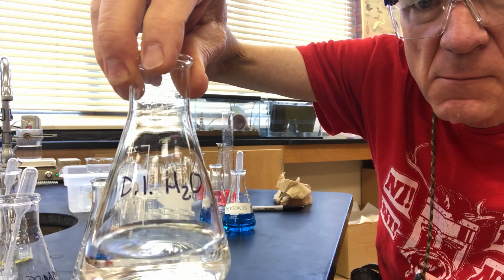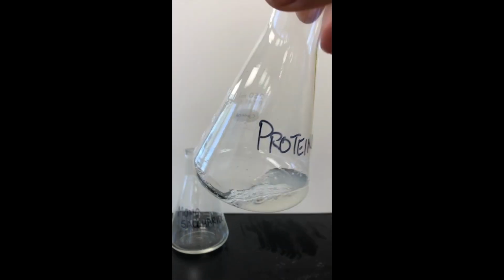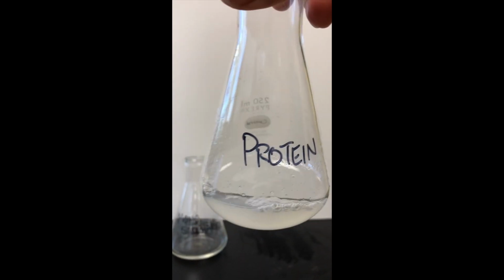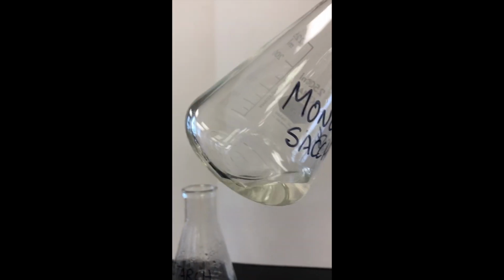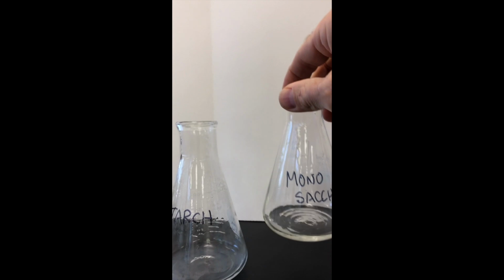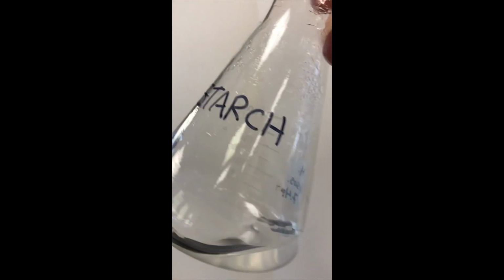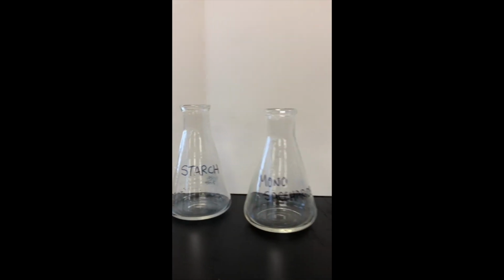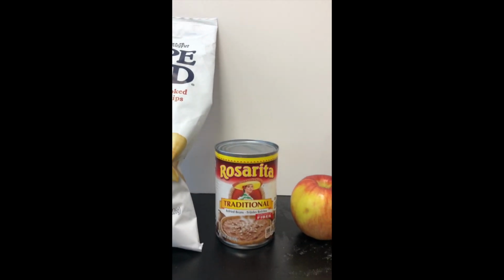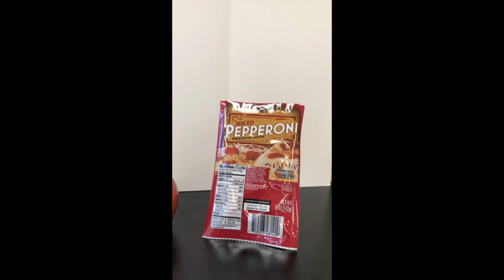The samples for the positive and negative controls are deionized water, corn oil, and 10% solutions of egg albumin as the protein, fructose as our monosaccharide, and potato starch as our polysaccharide. The mixtures of the unknown macromolecules are contained in the following foods: potato chips, refried beans, apple, and pepperoni.